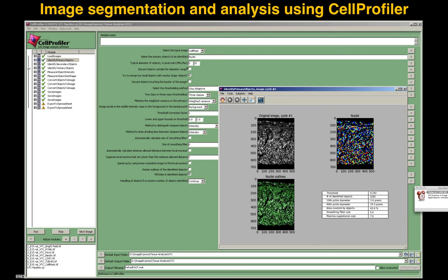And the nuclei in this case have been identified by cell size or nuclear size. You can see in the panel on the right the color-coded images, and these color codes don't mean different fluorescences, they just mean different segmentation, that the segmentation has identified all of the individual compartments, all of the individual nuclei, or all the individual cells in this image.